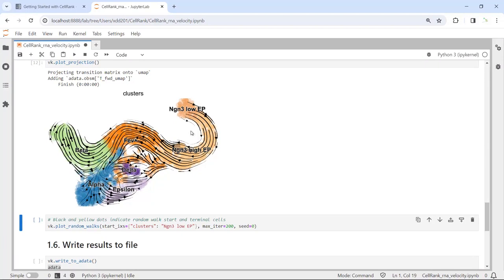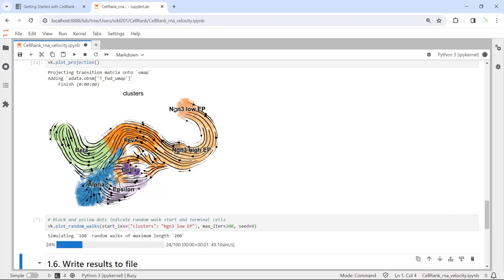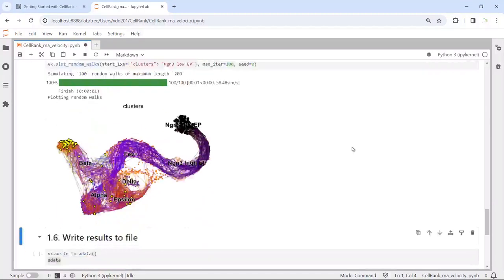The progenitor cells are the NGN3 low EP cell clusters, which generate other endocrine cell types in the pancreas. We can also plot the random walks using a function in the CellRank package, setting the starter cell cluster as NGN3 low EP cells. Running this plot function, we can see the random walks generated — the black dot indicates the initial cell state and the yellow dot indicates the terminal stage cells.